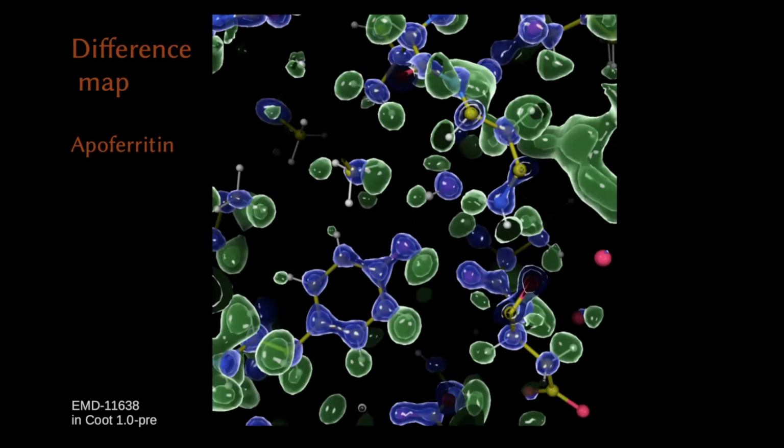So I've taken just the positive level of the difference map here, and we are looking at a map that's been calculated without hydrogens being in the model. And this is an FO-FC map, and you can see density that this particular part of the structure illustrates a hydrogen bond network, including a water. That's at the middle of the screen there, slightly to the top right at the 2 o'clock position.